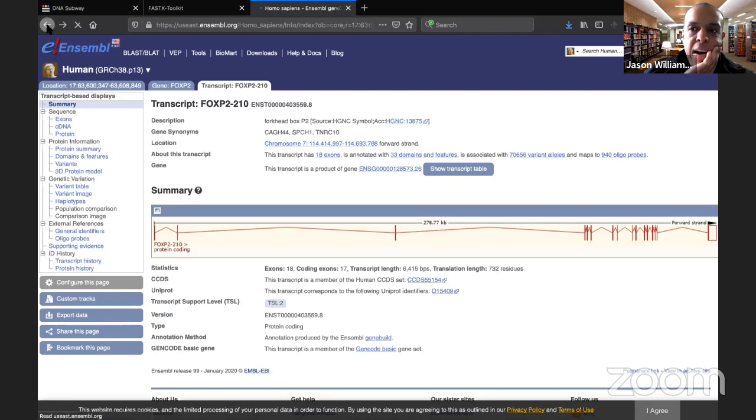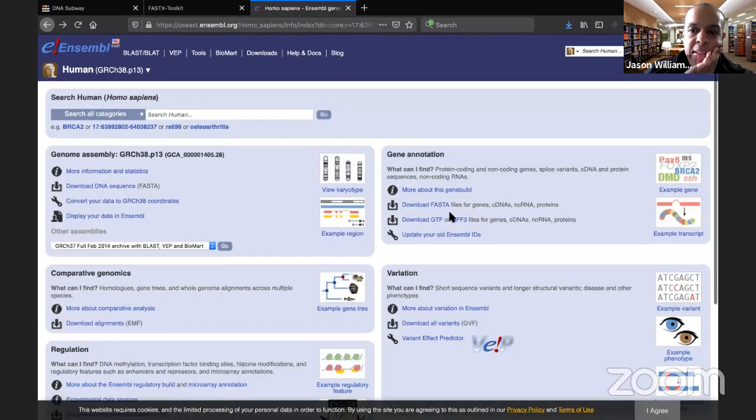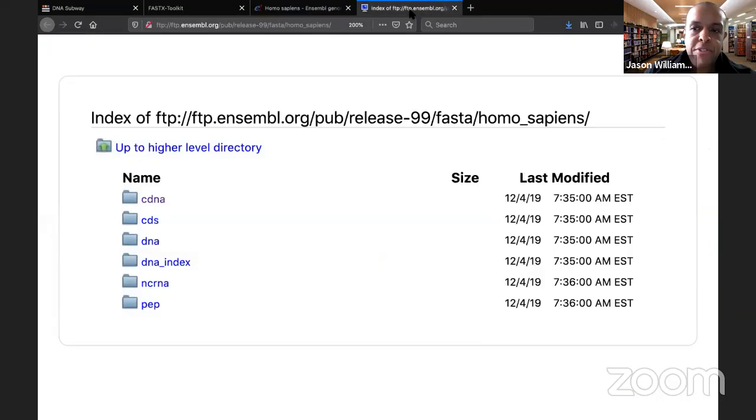So the alternative would be to download the entire human genome. We're not going to do that. We could do that. And in fact, some RNA-Seq programs will align to the entire human genome. But if you think about it, we don't need the introns, right? And we don't need large sections of the genome where there's not any gene expression going on. It's true that gene expression is not confined to protein coding genes, but we could skip it for the sake of what we're doing.